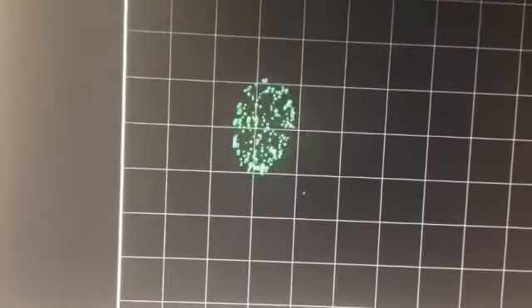And if we go through the movie, you can see that for the most part there is pretty good picking up of the dots. You might have to go through and manually remove some of those. But it's pretty good. Okay, so that's the basic starting of it.